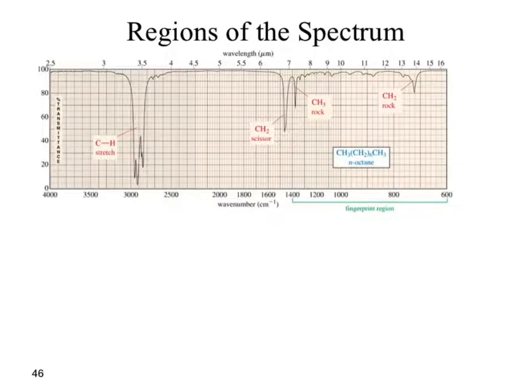So, within our regions, what we want to be able to do is look at that spectra and come to as quick an analysis as possible. Your textbook, again, will show you a bunch of different things to evaluate. What we talked about was 1,400 and lower we should ignore, so we can immediately draw a line. Those two things disappear. Remember how I said 1,600 and lower is a dangerous region? That spectra has one signal for me to evaluate.